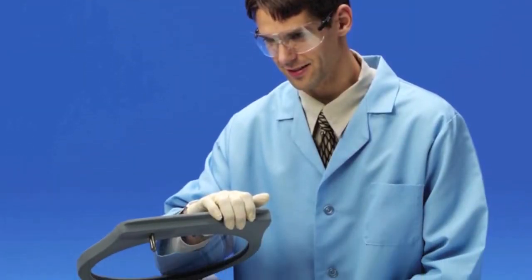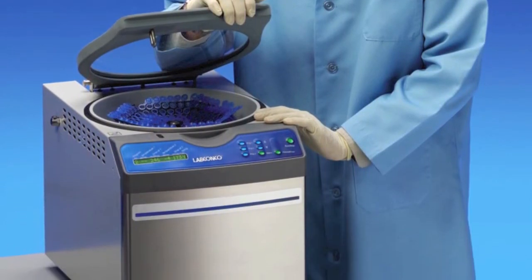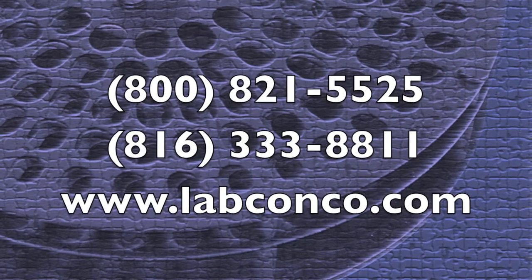The refrigerated Centrivap is available in both a standard chamber model and an acid-resistant model. For more information, contact your LabConco representative.